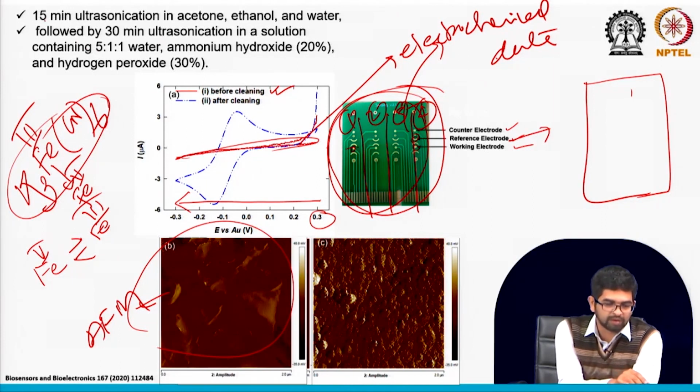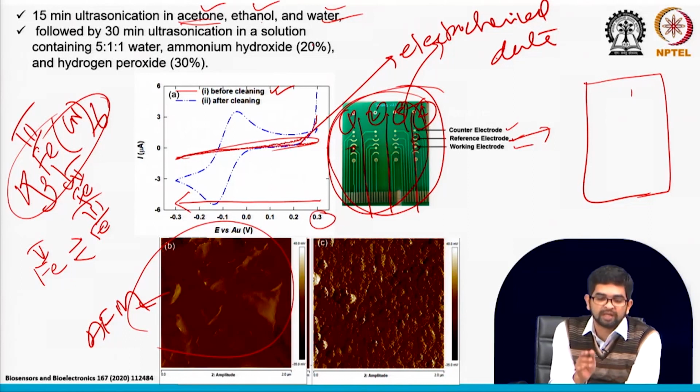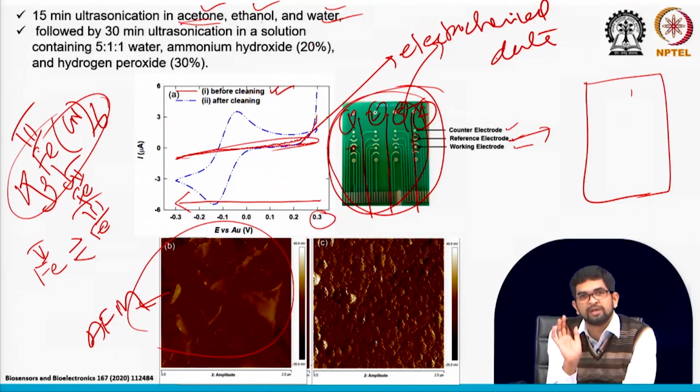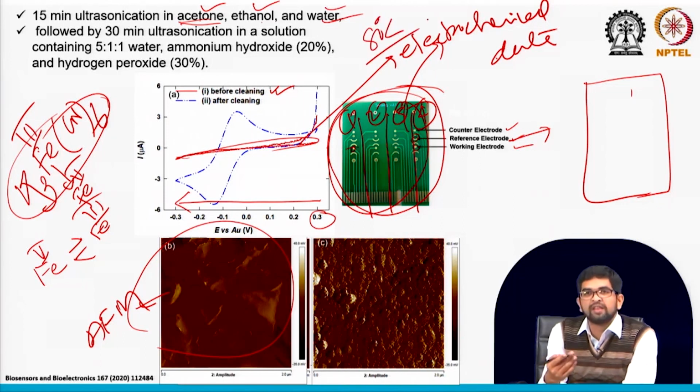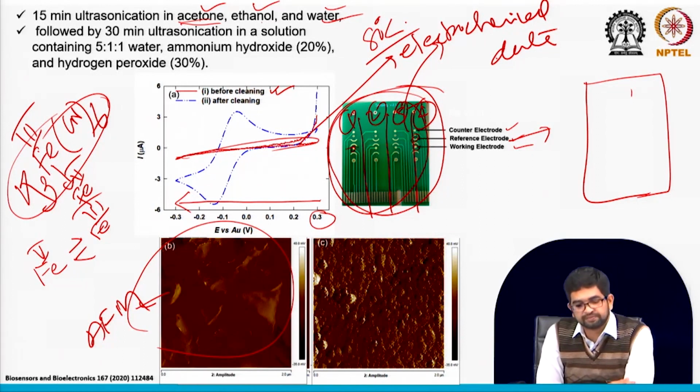So, one pretreatment method you can follow is 15-minute ultrasonication in acetone, ethanol and water. First a very non-polar solvent like acetone, then a little polar like ethanol, then polar water. You sonicate for 15 minutes each, followed by a mixture in 5:1:1 ratio of water, hydrogen peroxide and ammonium hydroxide. Then you can sonicate it, or even heat the solution around 80 degrees Celsius for about 1 hour. Then you clean the surface with DI water and let us see the electrochemical behavior.